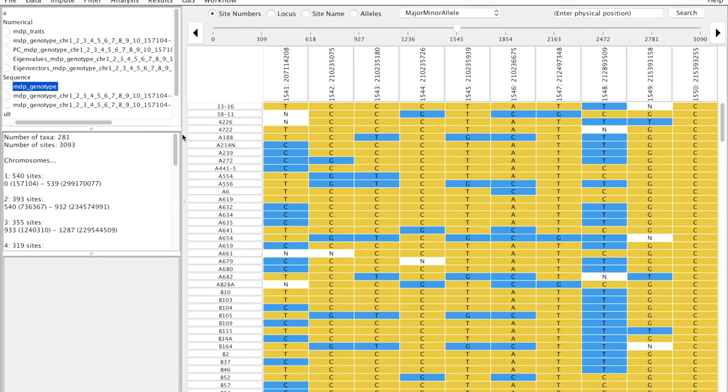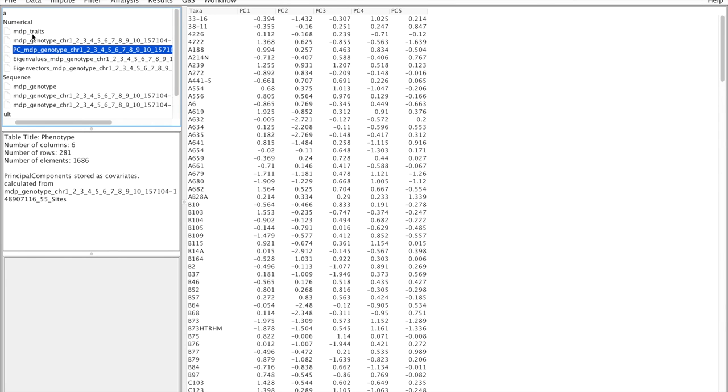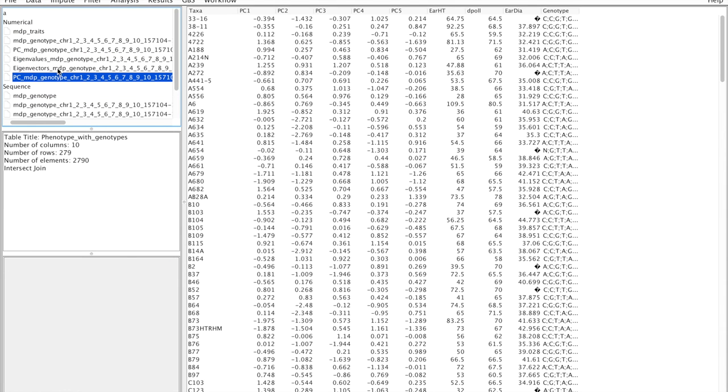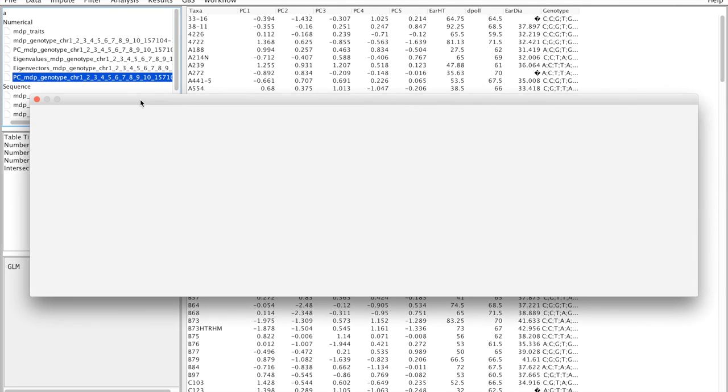So the way we're going to run this GLM with principal component analysis is going to be by selecting the phenotype, then we're going to select the principal components. We're going to select them together and we're going to select our filtered genotype table. Now after doing that we say Data, Intersect Join so that all this is joined together and you can see now that we have the taxa, the covariates that are principal components, we have our phenotypes and we have our genotypes. So we're going to do Analysis, GLM.